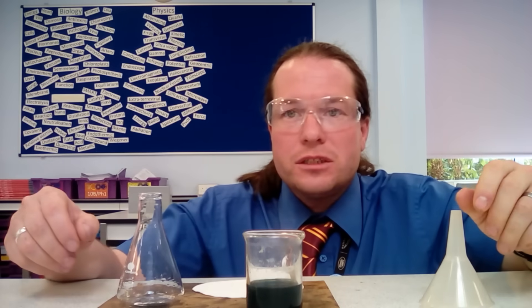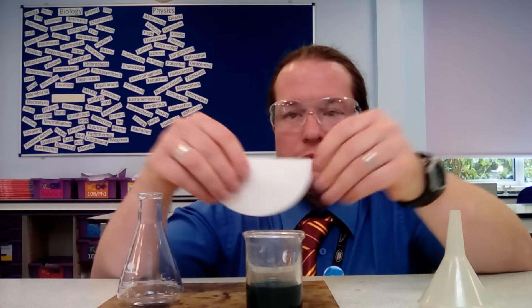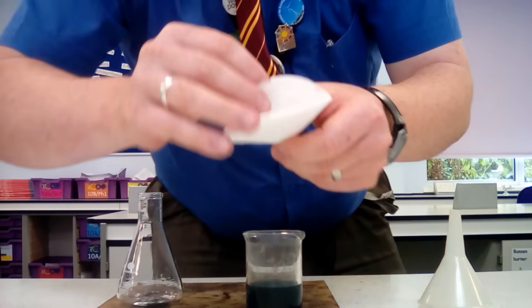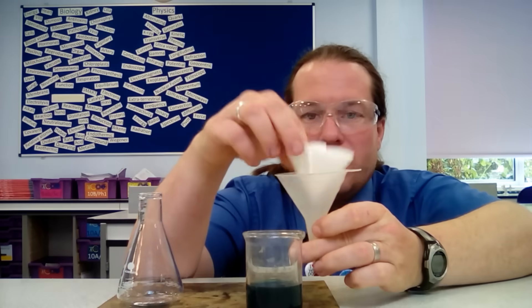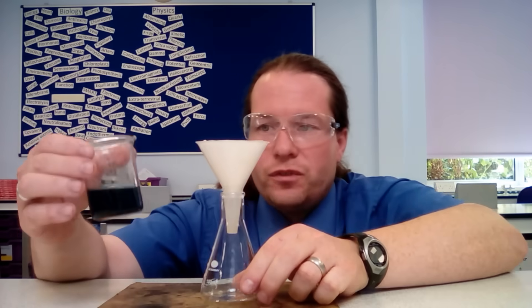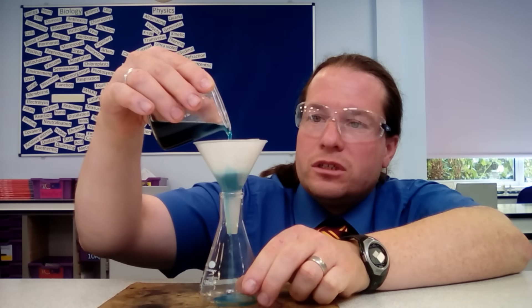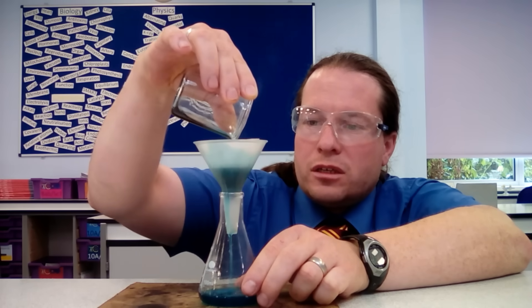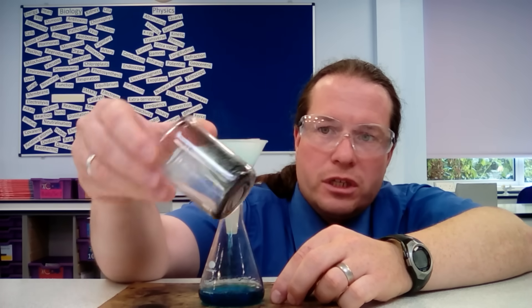Having cleared away our heating apparatus, we're now onto the filtration step. We take our filter paper, fold it in half, and then fold it in half again. That gives us a cone with four layers — we take three layers to one side and one to the other to form a cone. That goes into our filter funnel, which stands in our conical flask. We add our sulfuric acid and copper oxide reaction mixture into the filter funnel, and we can see the copper sulfate solution filtering through beautifully, with unreacted copper oxide left behind.